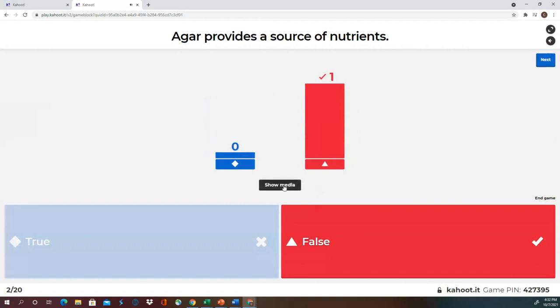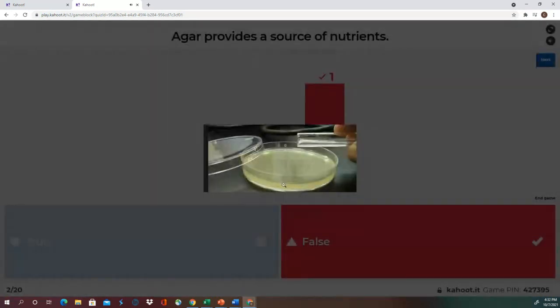All right, so the media shown in this picture is an agar plate, hence the Petri dish. And remember that agar is a solidifying agent. That is it, okay? It offers no nutritional value for the microorganism. And that's a really good thing because remember, Hesse is the woman who suggested we use agar in media because previously they'd been using gelatin, and that was able to be used as a source of nutrition for the microbes.